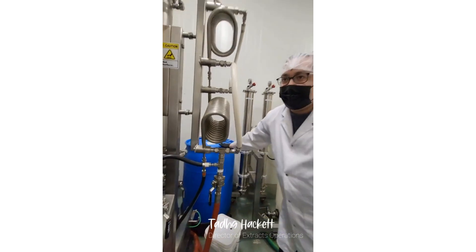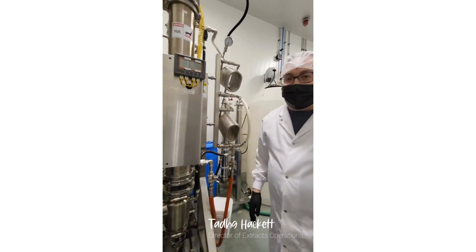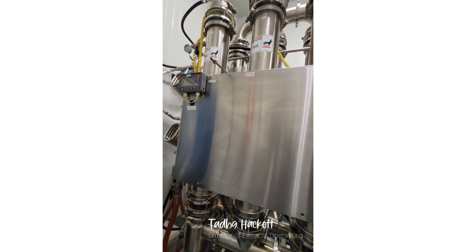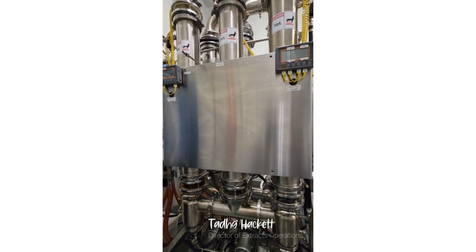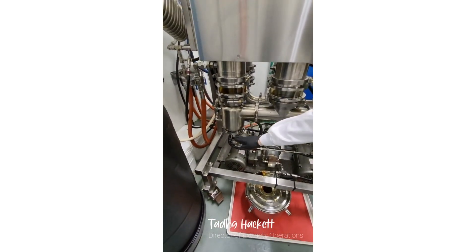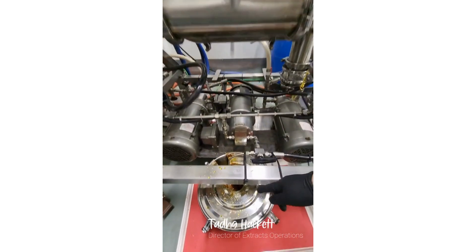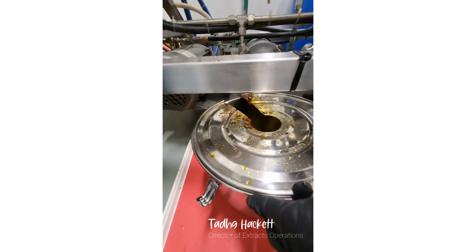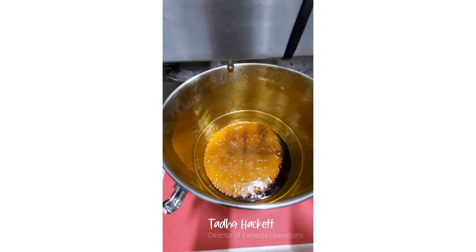So we recover 95-plus percent of our ethanol. It's pumped out into a collecting vessel like this — I'll just clean the lid there. You can see that it's pre-decarb crude.